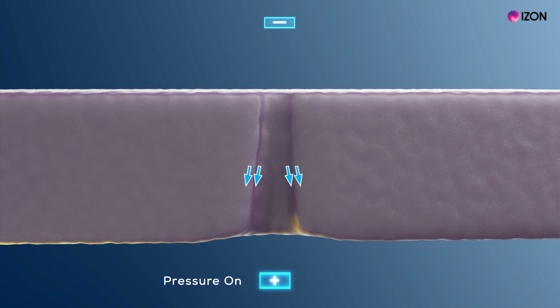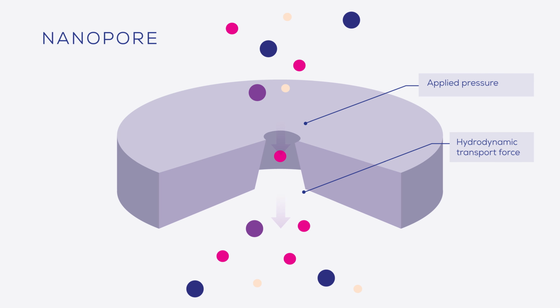The liquid in the centre of the pore moves the fastest, and slower towards the pore walls. We are talking about a parabolic flow profile. When we now put a particle in this flow field, a force will act on it. The force originates from the variation of the pressure and viscous forces on the particle surface. For the dimensions and applied pressures typical for TRPS nanopores, the particle follows the flow lines of undisturbed fluid flow and moves together with the fluid through the nanopore.